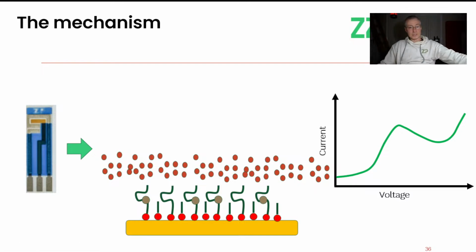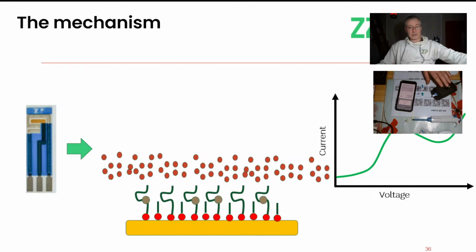We would have used square wave voltammetry. It's just a personal preference, but this instrument is very powerful for it and does a nice job, because it would have turned the decrease in signal that they're getting into a concentration of that ferritin. So they were actually not finished at TRL3.